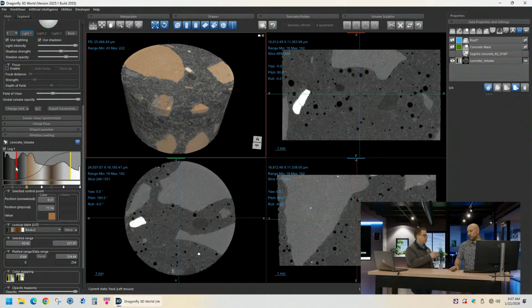So it's basically like a bar chart, showing the number of voxels. We call them voxels because they're 3D pixels. In each of those intensity buckets. And you can see these little mounds or isolated peaks here. Each one of these is where there's more data.